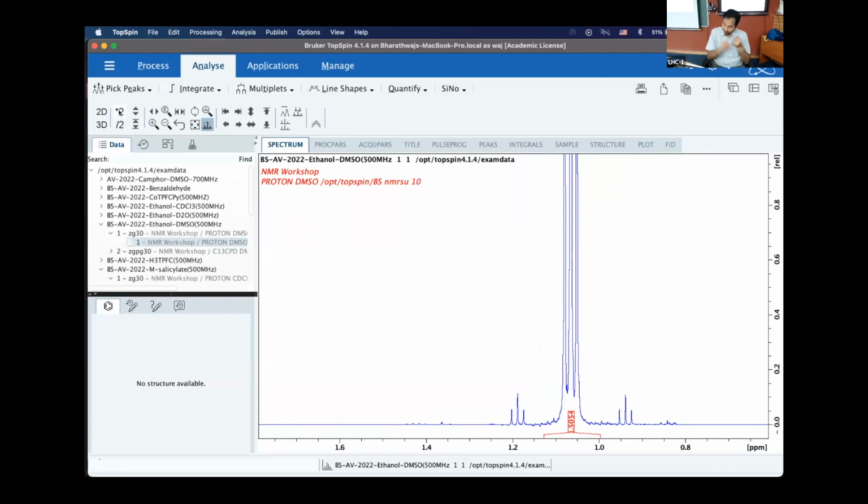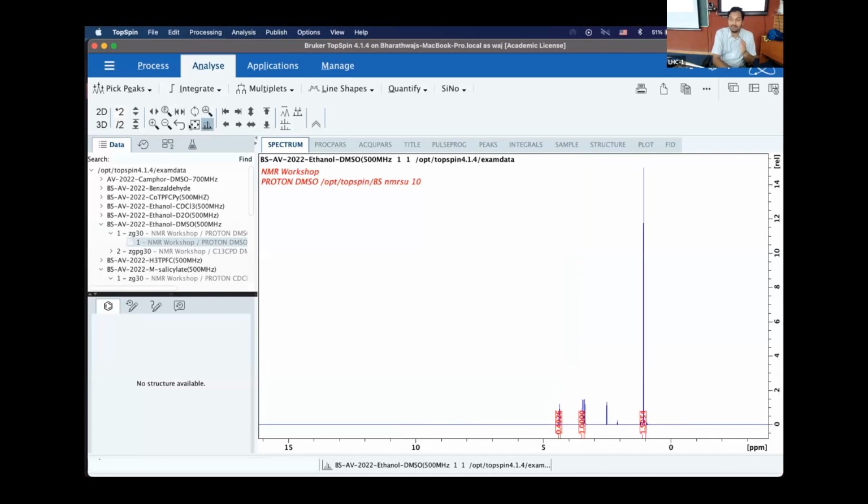Only when you carefully set up the experiment and carefully do the integration, you'll get some quantitation within this system. If you didn't set up the experiment, this quantitation is gone. Set up the experiment properly and didn't do the integration properly, you'll get something wrong. Assuming you do all this properly within the molecule, you can semi-quantitate. Quantitating across ethanol and water might be a little tricky, assuming there's good resolution and you don't have overlaps. So NMR is a semi-quantitative technique. It's not fully quantitative.